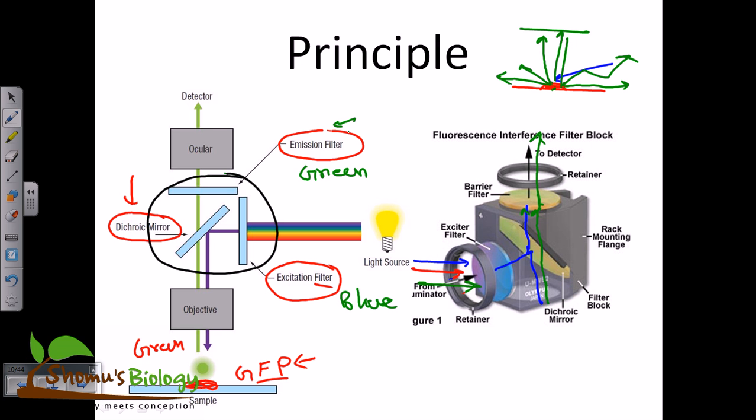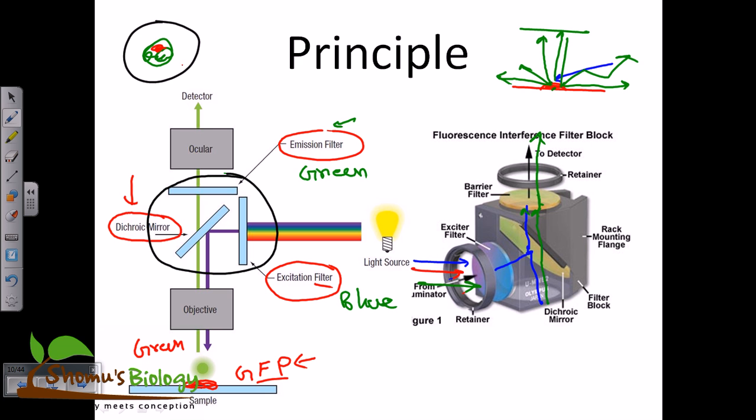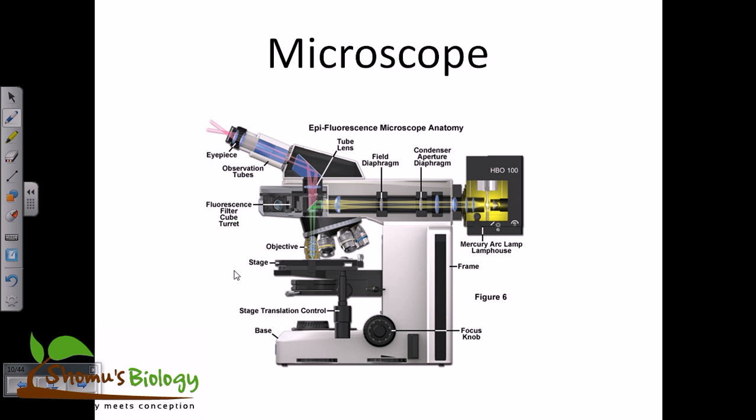Fluorescence microscopy also helps us understand the contrast of a particular thing, because in normal microscopy you don't see such a contrast. But in fluorescence microscopy, in this complete cell, only the place where we add our dye shows the image. The rest will not show any image; the rest will be black. So that is the idea: good contrast, as well as this beautiful imaging technique with high resolution. Now this is the structure of a microscope.